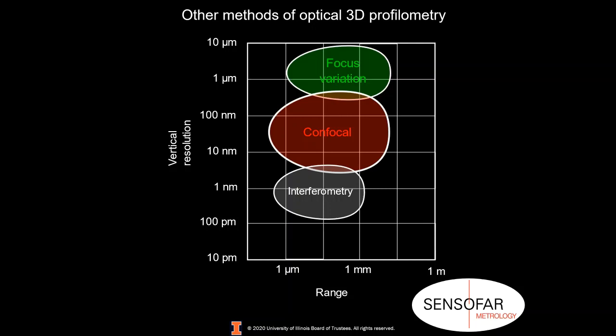Kathy, the sample that you showed with the pattern, can you comment on the image processing necessary to get rid of some of the edge effects on those samples? The pattern sample, I believe, is the AFM grating. And I'll try to bring that up here. I am just getting that.